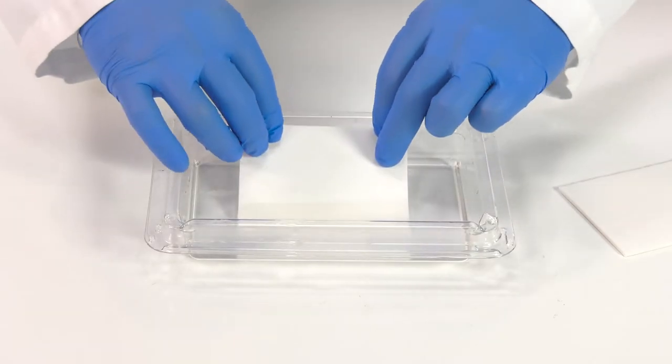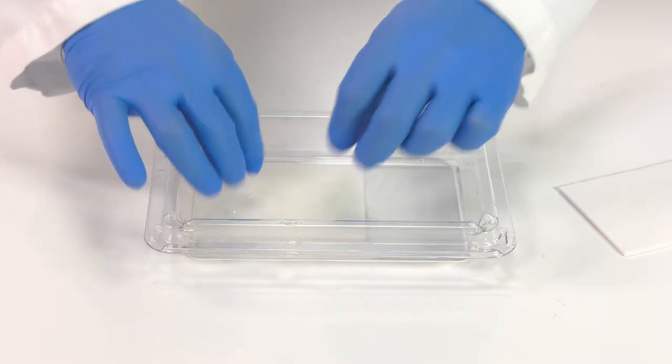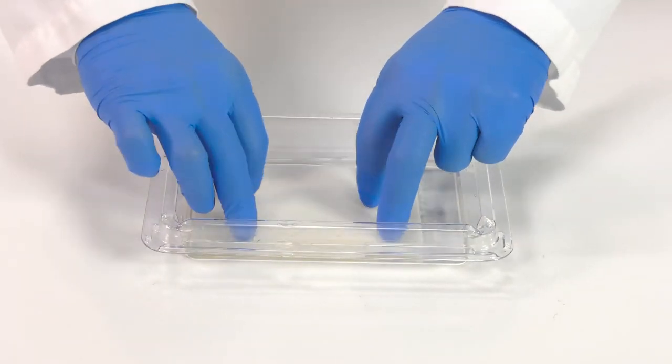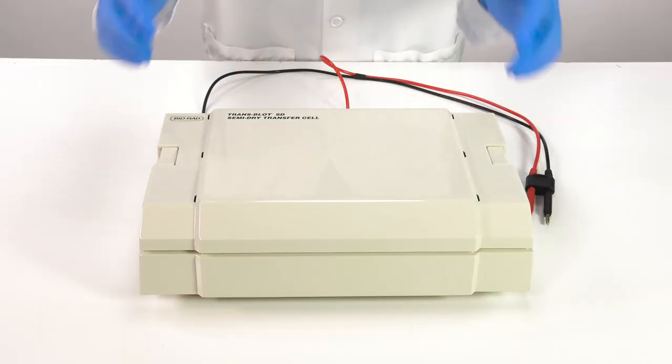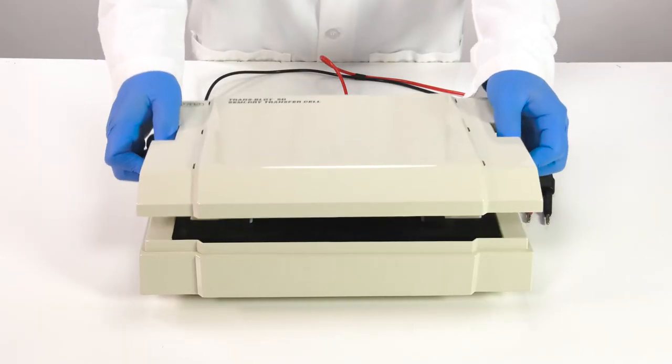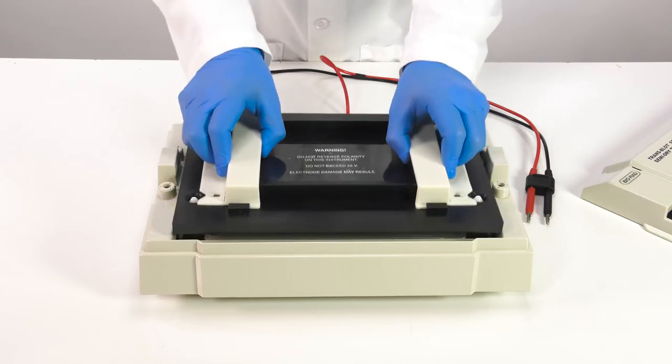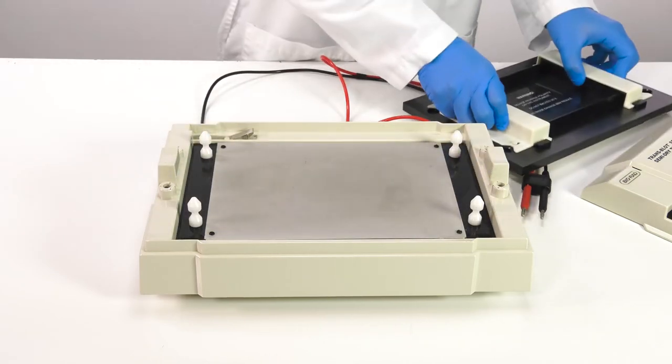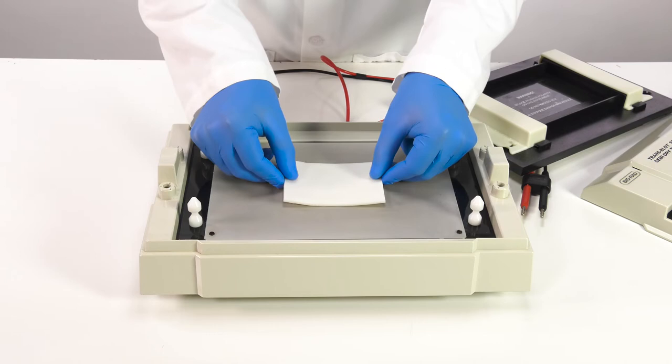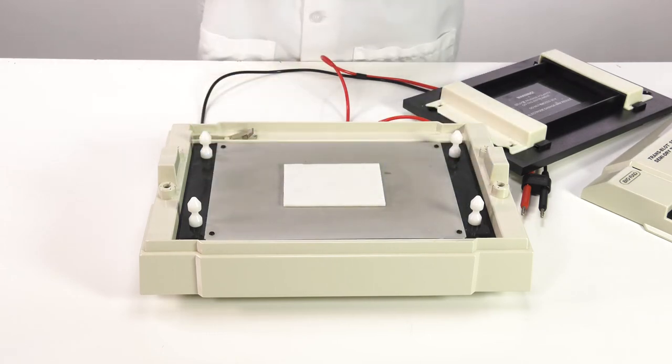Completely saturate two pieces of extra thick filter paper in transfer buffer. Remove the safety cover and cathode assembly from the instrument. Place a pre-soaked piece of filter paper onto the platinum anode.